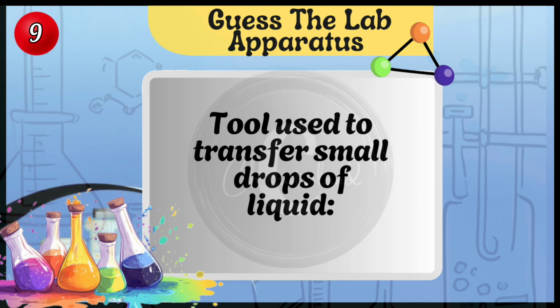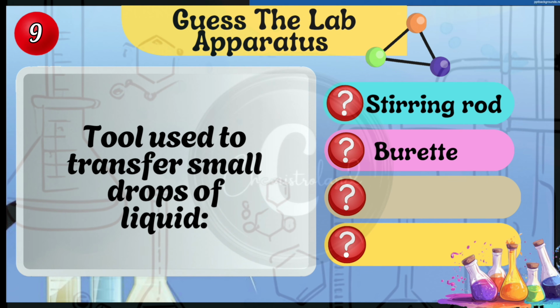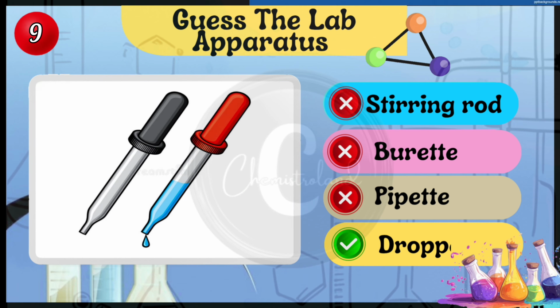Any ideas about the tool used to transfer small drops of liquid? Hints for your help are stirring rod, burette, pipette, and dropper. Dropper.